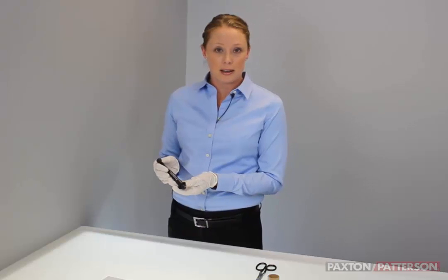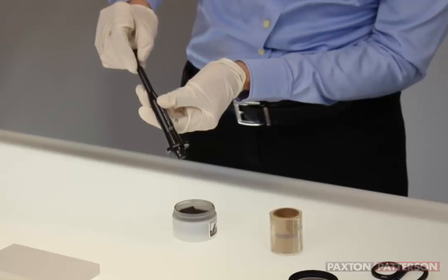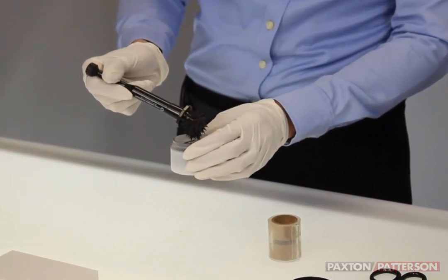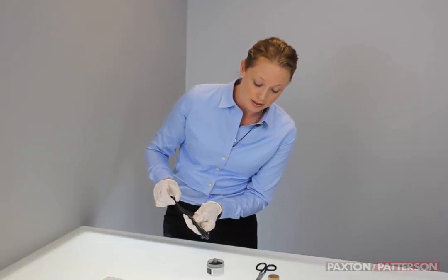We're going to be using magnetic fingerprint powder and a magnetic fingerprint wand. I'll show you how the wand works. If you just have the end depressed, it will pick up the magnetic fibers. If you pull on the end, it releases the magnetic fibers.